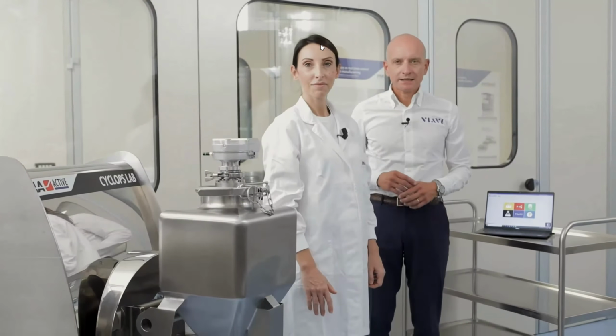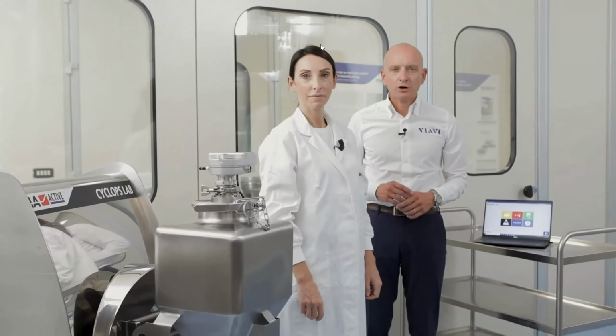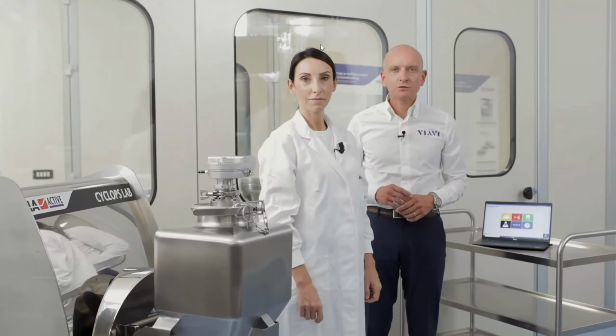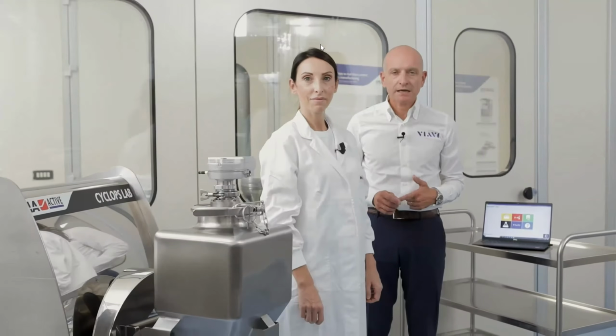Clearly, there are three disadvantages. First of all, as I just said, you need to perform the analysis offline and bring the sample to the laboratory. The second point is that it's time-consuming and also quite expensive because for every sample you need to come to the laboratory and do an HPLC analysis.